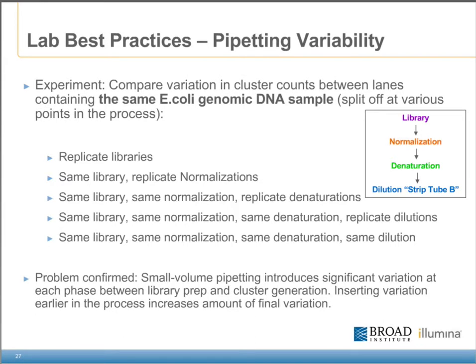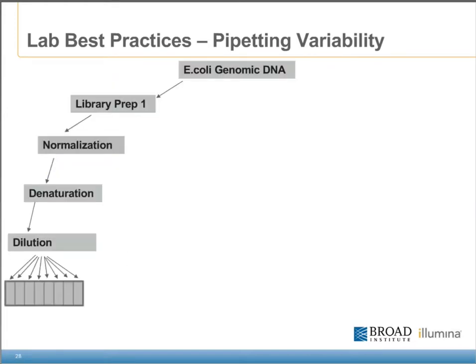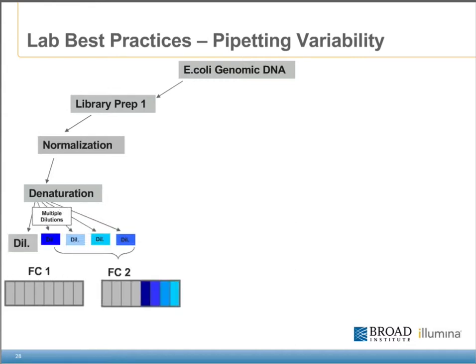I want to cover one last thing on the topic of cluster densities — an experiment that illustrates the effects of pipetting small volumes. It was performed by Niall Gormley at Illumina and controlled for variation introduced at each phase between library prep and cluster generation, by splitting a sample at various points and continuing with duplicates in parallel. It shows that the more small-volume pipetting steps a sample encounters, the more unpredictable its final result will be. The experimental design used five flow cells. For the first flow cell, a single genomic library was normalized, denatured, diluted, and loaded into all eight lanes. This dilution was also loaded onto four lanes on each of the other flow cells as a control. For the second flow cell, four lanes were the same dilution as on flow cell one; the other lanes took the same denaturation but were diluted four separate times, attempting to perform exactly the same dilution four times.